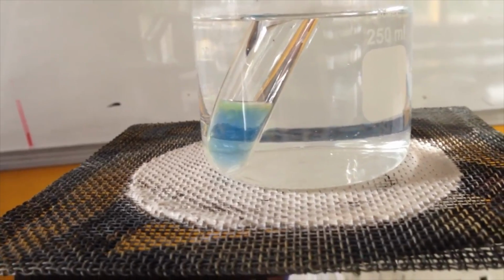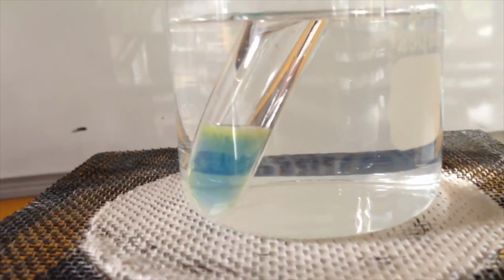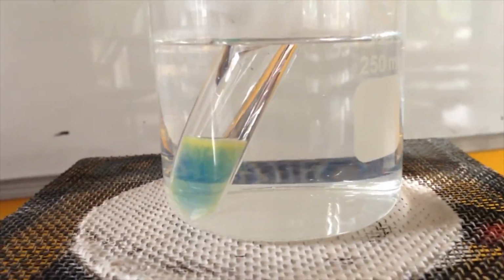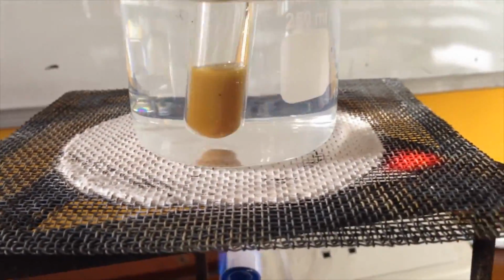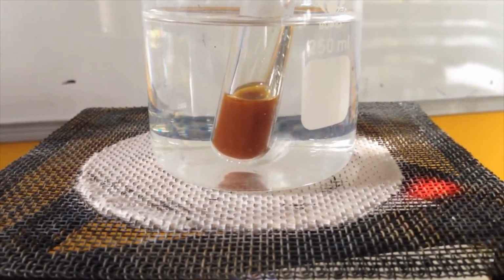So here is my sample that I'm heating here. Already we can start to see a colour change at the top here. And now we can start to see the red colour coming through.